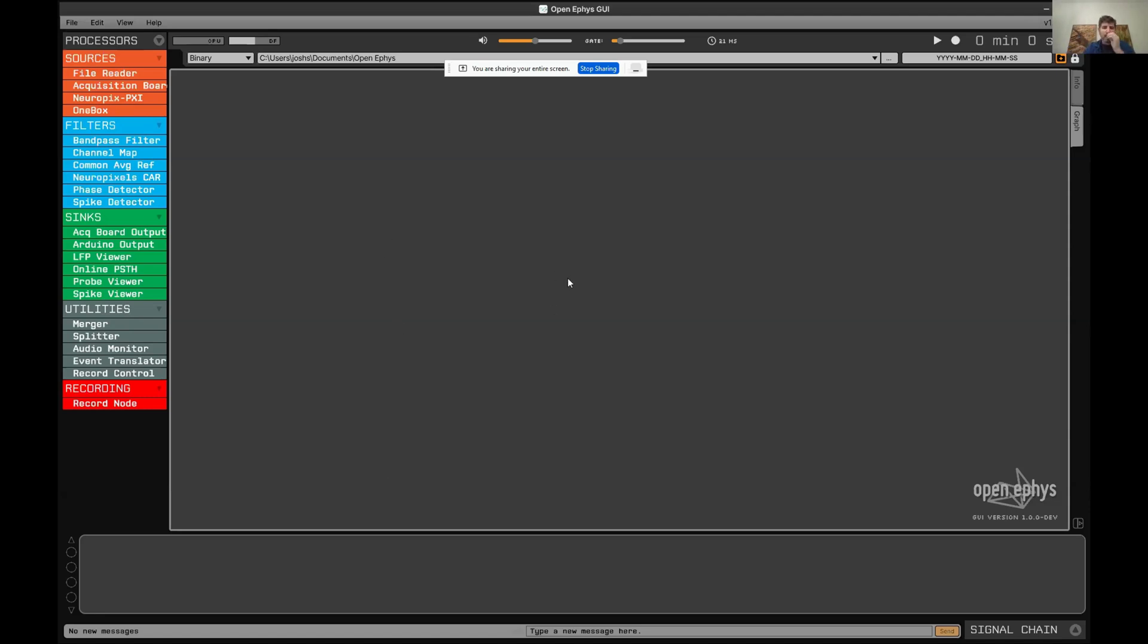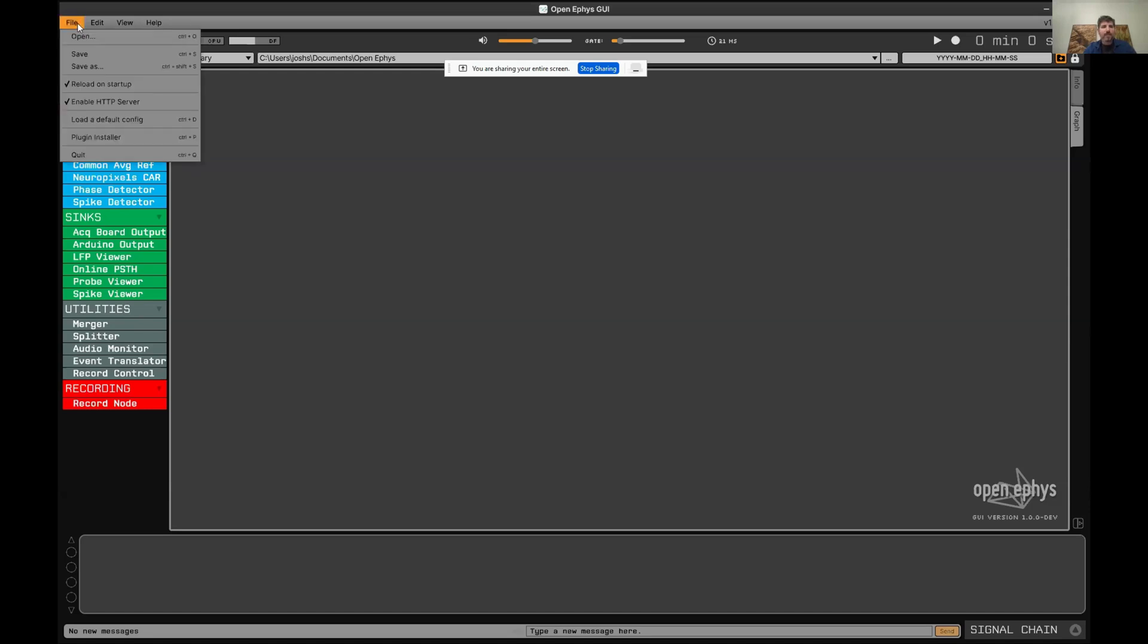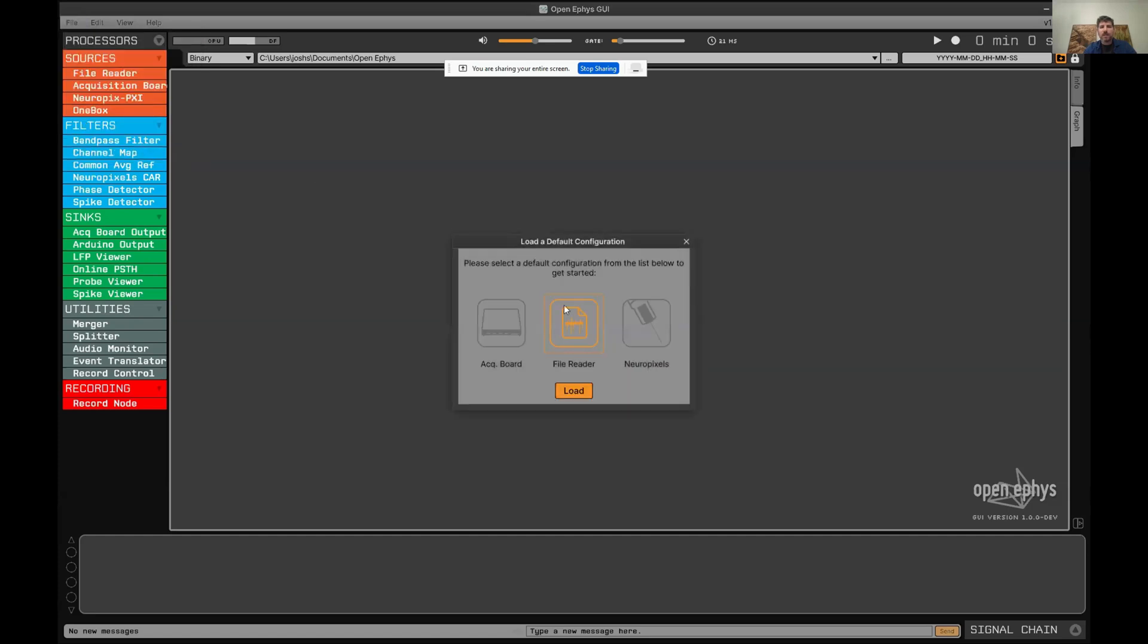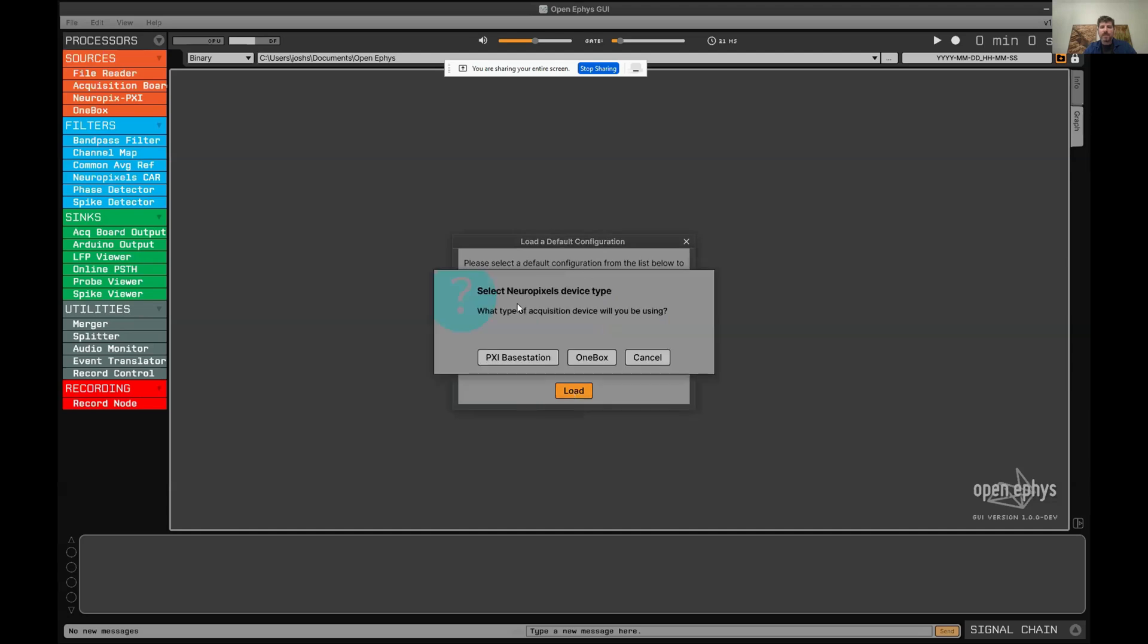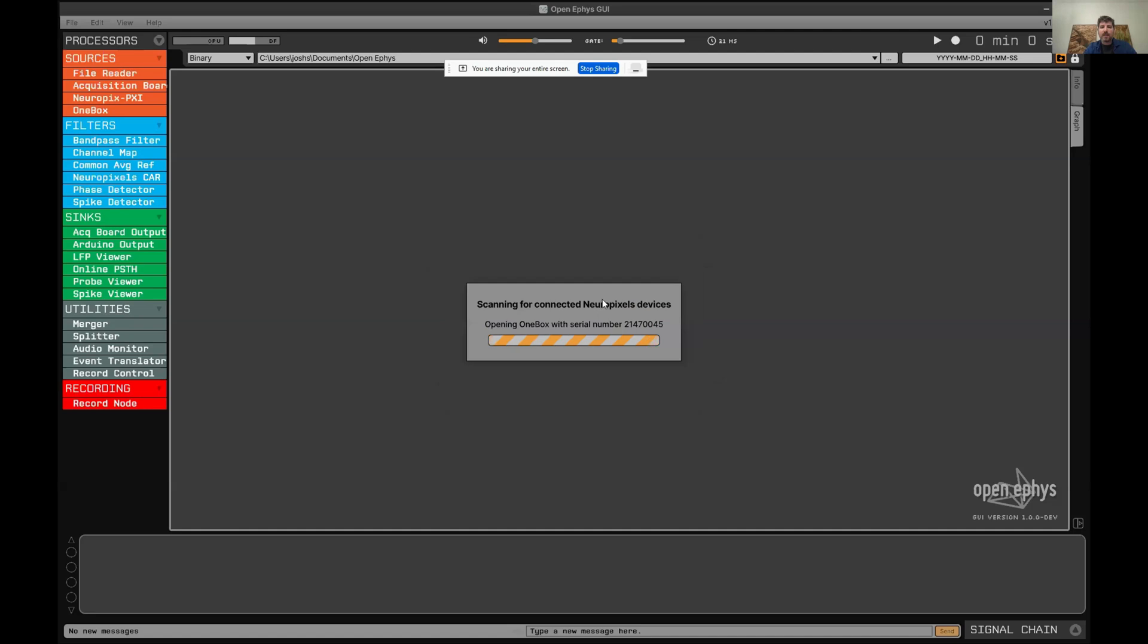This is what the user interface looks like when you first load it. If you don't know which plugins you want to use, you can load a default configuration, which we have for acquisition board, file reader, and Neuropixels. If you select Neuropixels, it asks you if you want to use a PXI base station or OneBox. I'll click OneBox.